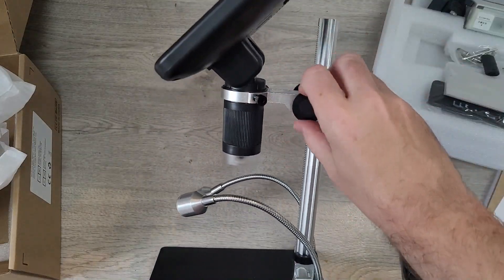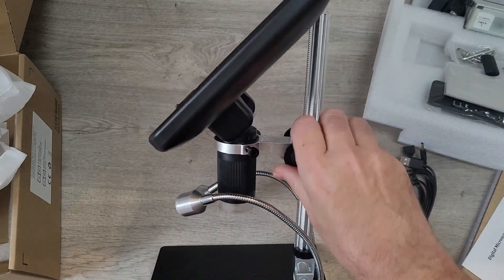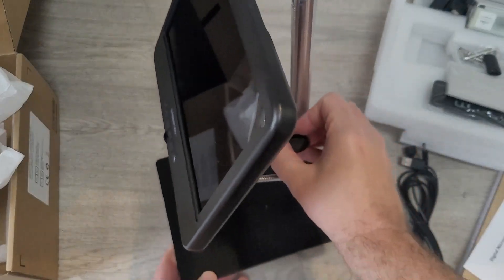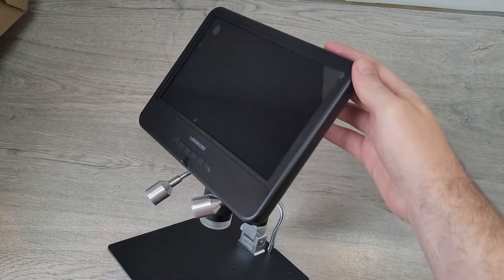There's a nice big dial on the side which you simply turn to move the head up or down. The screen itself is also adjustable, so you can move it back or forward depending on angles and lighting conditions.